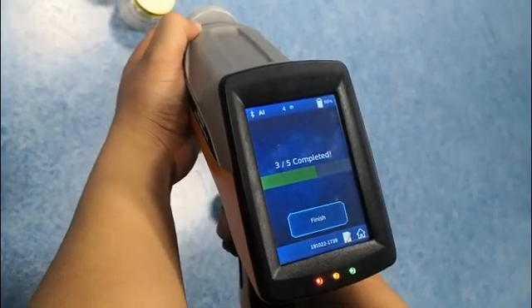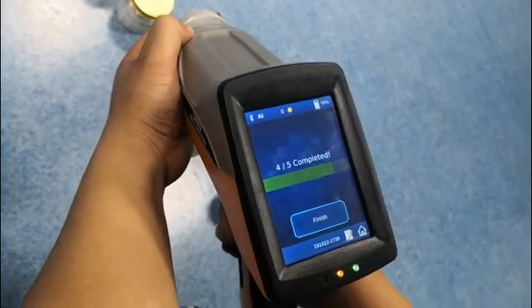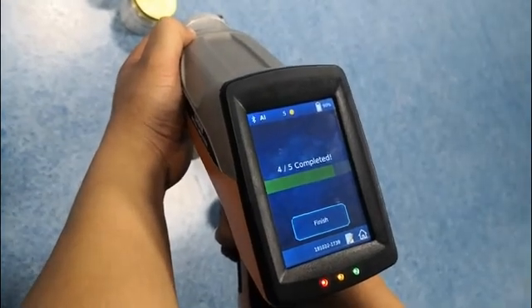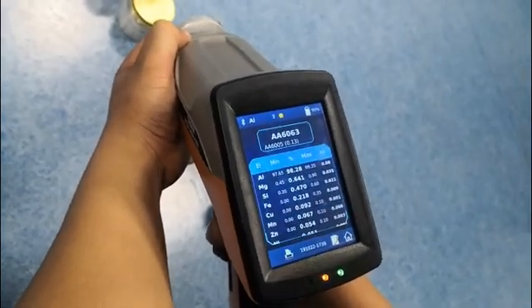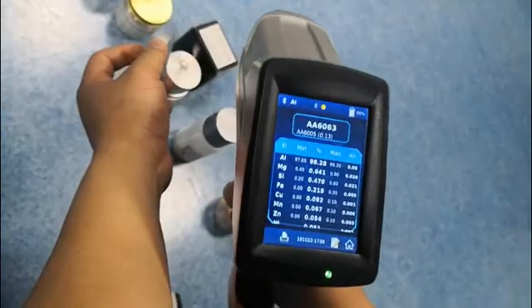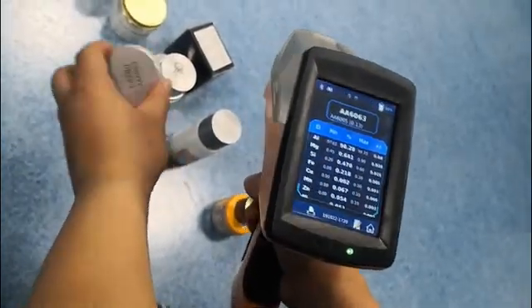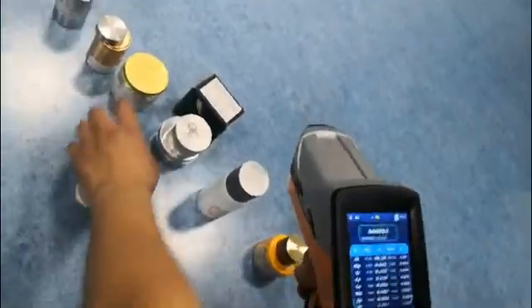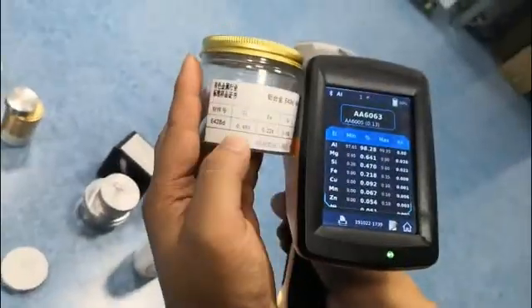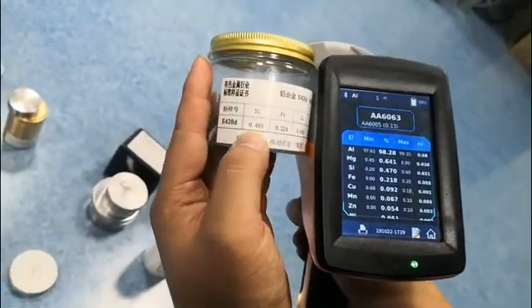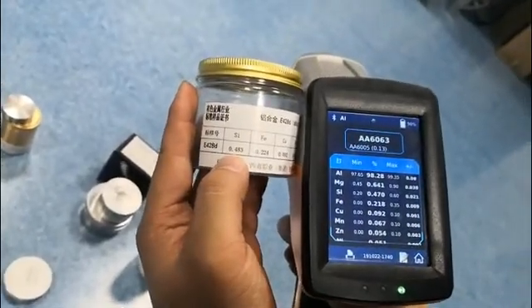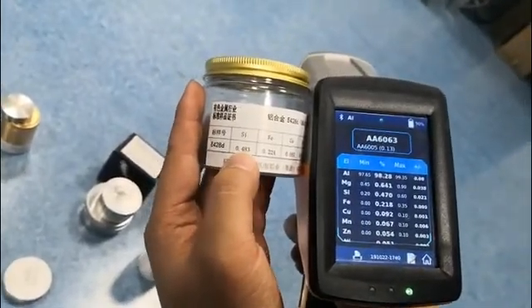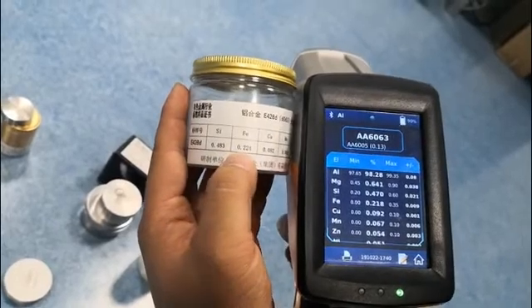Four time, five time. Okay, this is 6063. Now we can compare with the standard: silicon, iron, copper. You can see the accuracy. Okay, now we move to copper base.